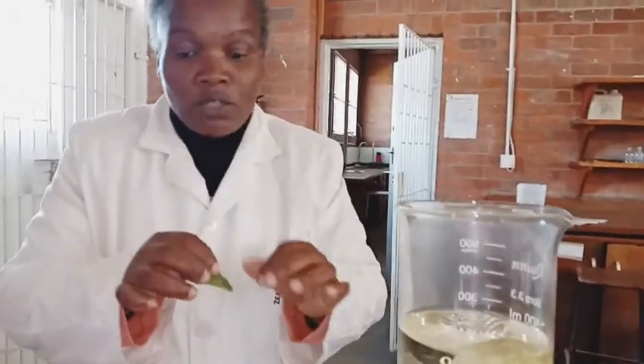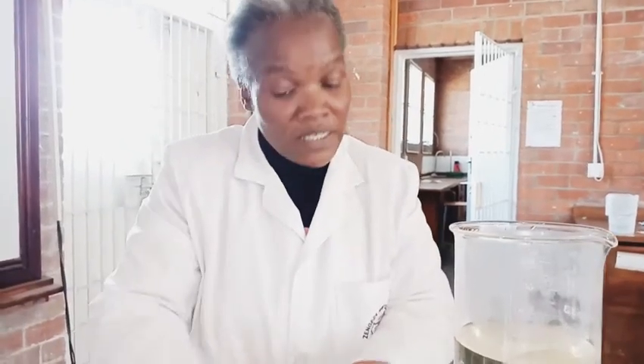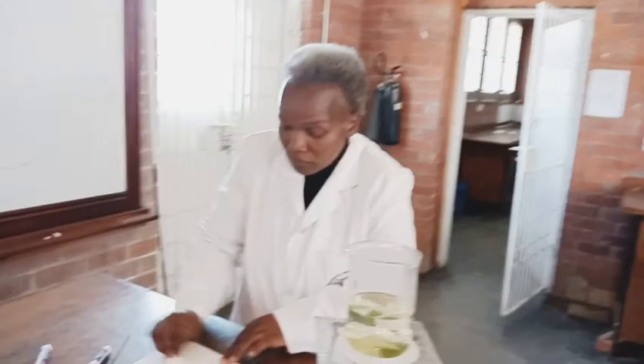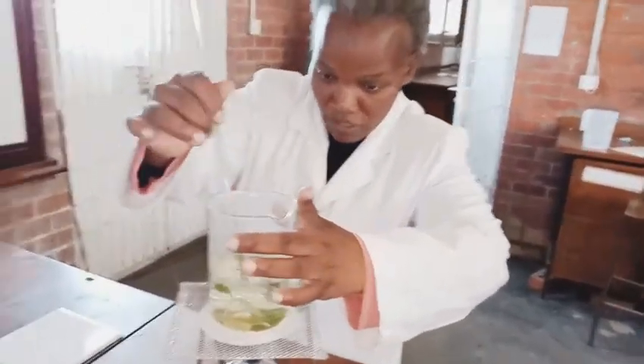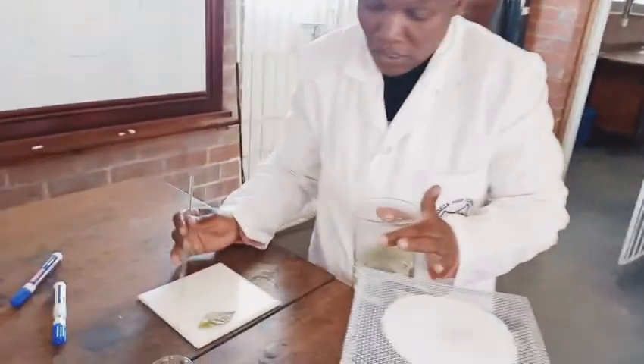This third stage - why we need to dip in water again - is because when you boil the leaf in alcohol it makes it a bit brittle, so it is now a bit hard and breaks very easily. But after dipping it in water you soften the leaves. I've dipped my leaves - it just takes a minute. So we've softened the leaves, making them easier to spread and also making them more permeable. Now let's get our iodine, which is used to test for starch.